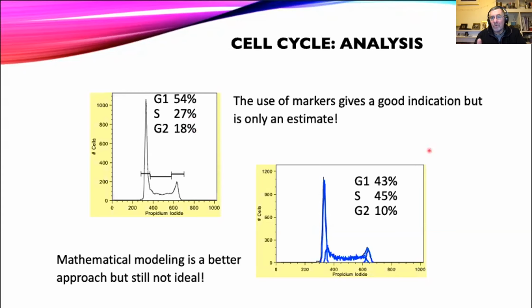Now, it may not matter which one of those you use. Sometimes with DNA analysis, it really is very qualitative. Have I blocked my cells and which phase they're in? But sometimes we do want to get those numbers. So that's what we'll do now. I'll hand it back to Kathy. I'll stop the share that screen.